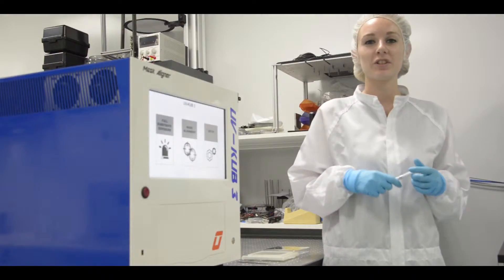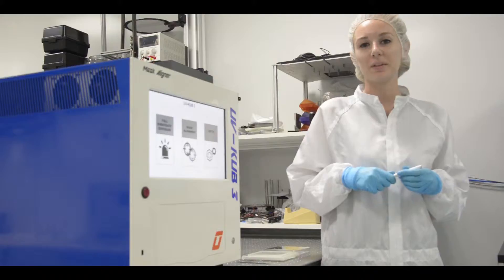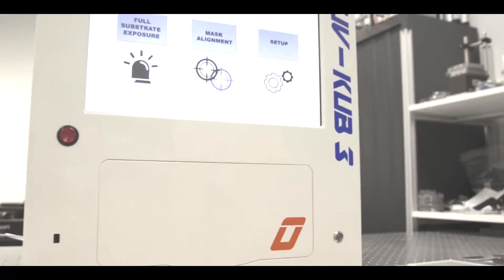I present you the UV-KUB 3, the next generation mask aligner, both compact, powerful, ergonomic and intuitive.